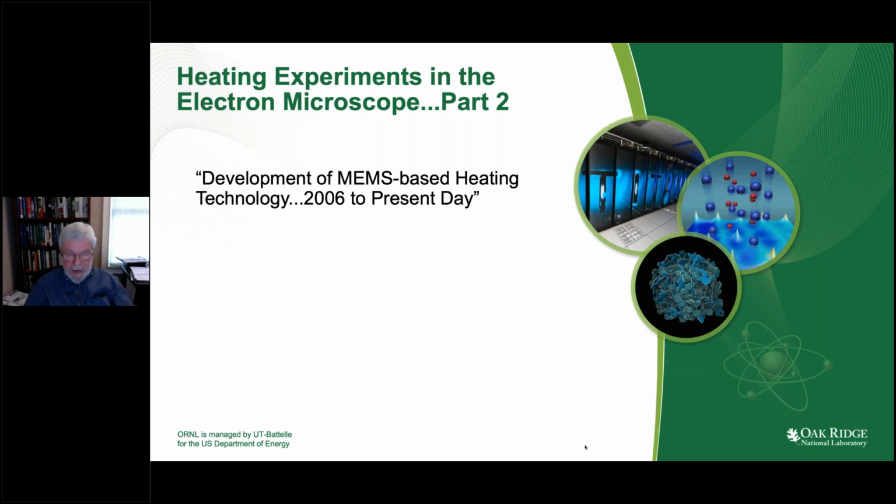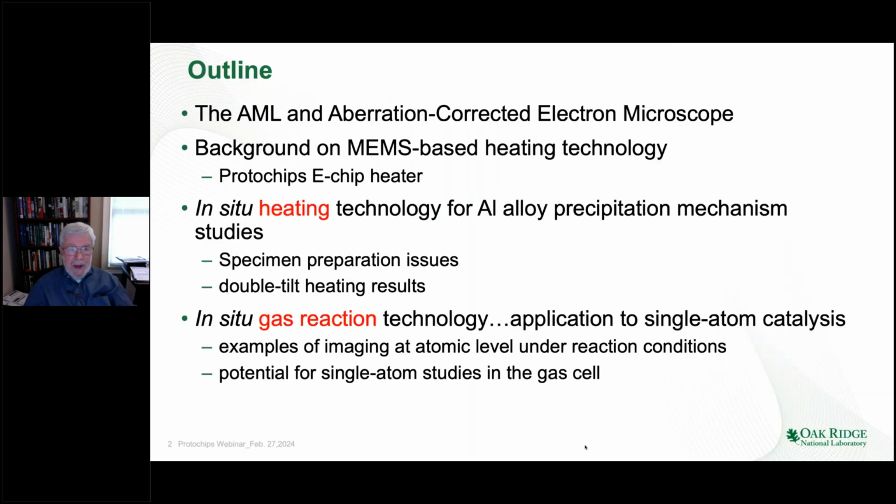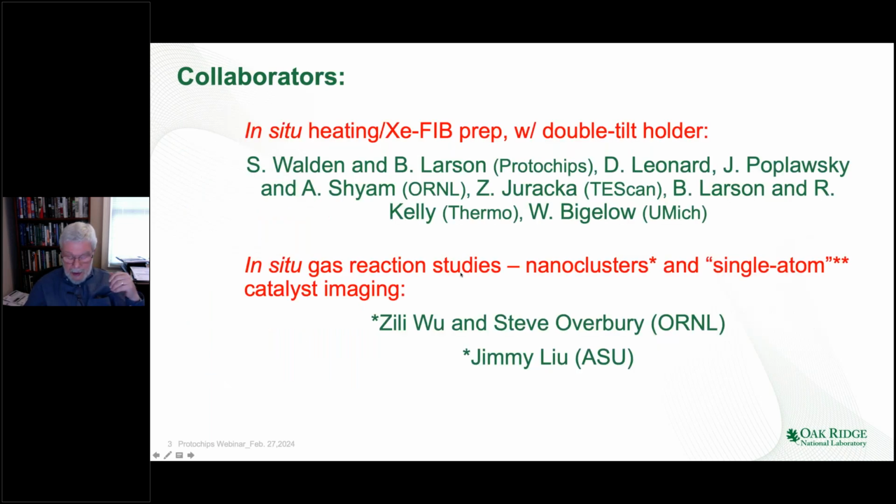The interesting part about this to me was that, here's the outline. AML is the Advanced Microscopy Lab. So I'll describe this a little bit, and then background on MEMS-based technology, in situ heating, and in situ gas reaction studies as part of the talk, and here's some of the collaborators.